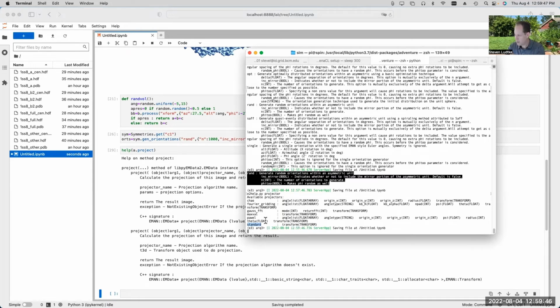So when you interpolate, you're using some sort of interpolation kernel, like say a Gaussian interpolation kernel. So you're pulling values in, sampling that Gaussian kernel for that one voxel from all the different slices that are some distance away from that voxel. When you make a projection, you're taking a single volume and you're interpolating a value in between voxels.